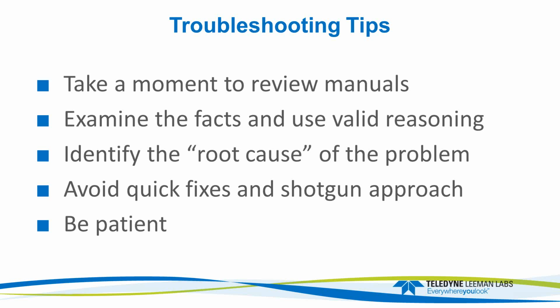You really want to identify the root cause of the problem, so you can get to the bottom of it and solve it, and not just provide a Band-Aid. So, for example, if you're having poor precision, and you just increase the integration time to 60 seconds, that problem goes away. Well, you haven't really solved the problem. You just put a Band-Aid on it. Avoid a shotgun approach. You want to be methodical. You don't want to change everything at one time. You want to make incremental changes, changing one thing at a time.